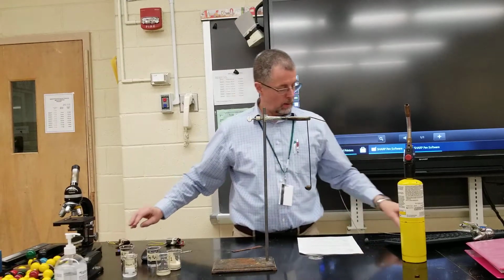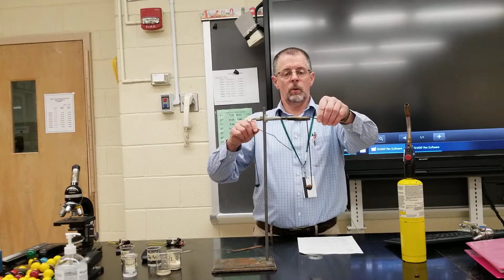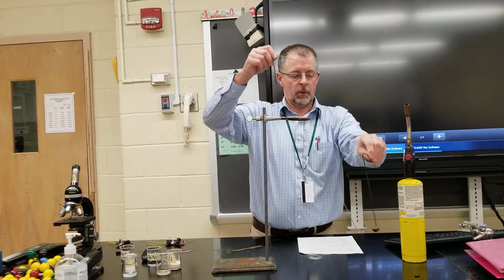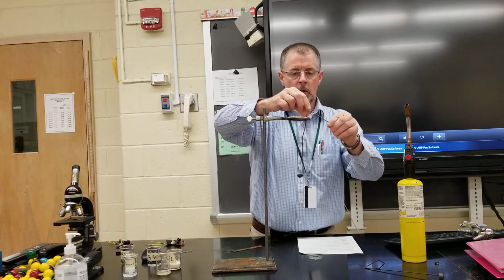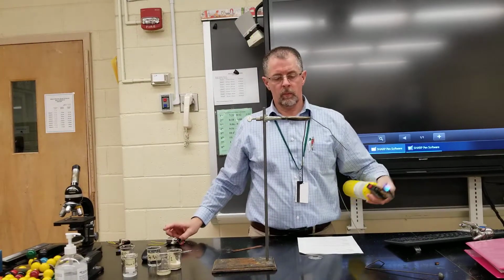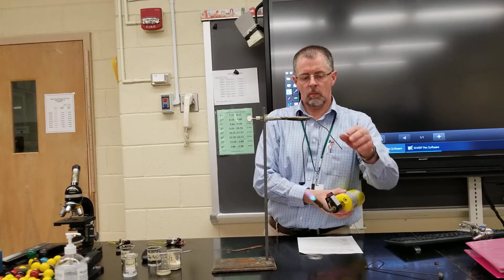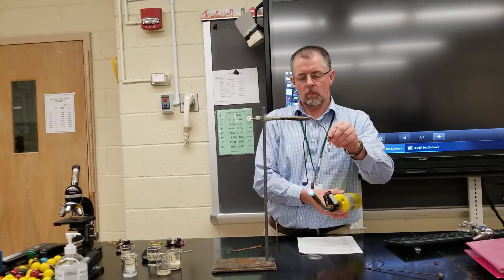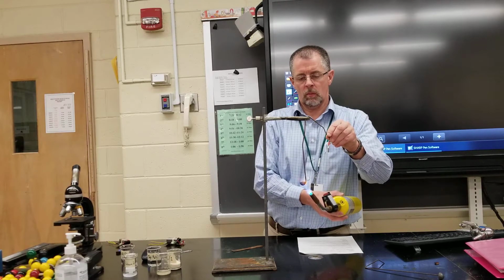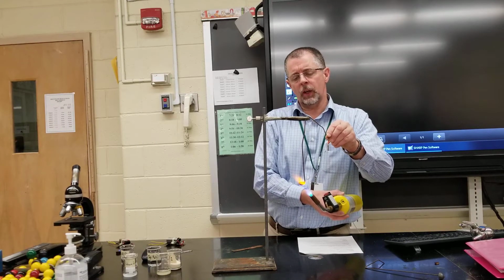Okay. Now we'll take unknown number 2, and we'll do the same procedure. Unknown number 2 is not melting as quickly.